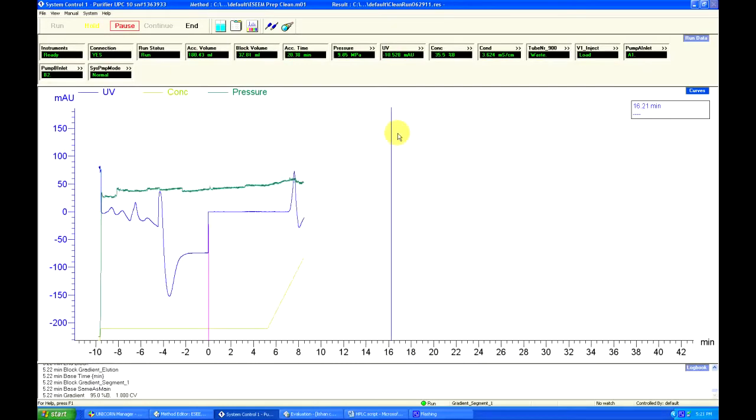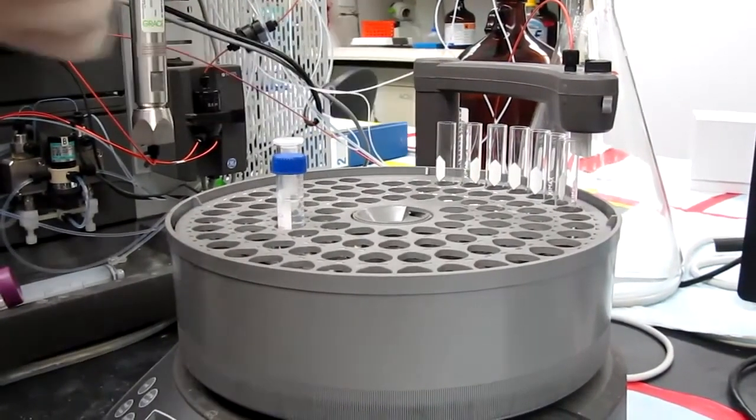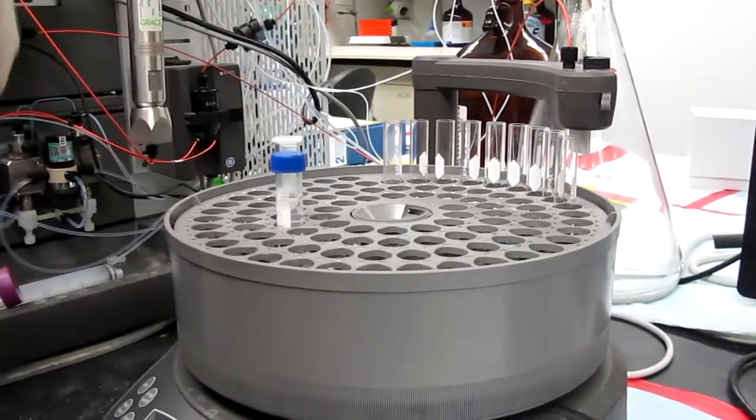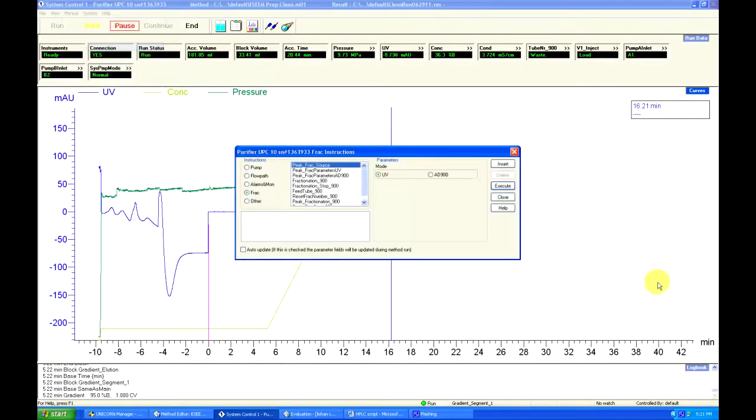Now we're nearing the part of the run where our sample elutes and we want to collect the peak. Make sure there are enough test tubes for the amount of fractions that you are going to collect. We click on Manual, then Frac to pop up the fractionation window. Choose Fractionation 900. Type into the message box the amount of milliliters to collect before the fraction collector changes tubes.